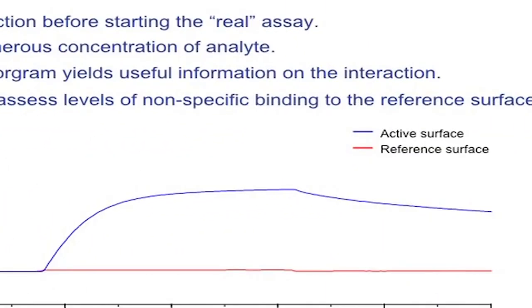Once the experimental conditions are set, the analytes are prepared, and the ligand is immobilized, it's a very good way to start by injecting a small amount of your sample to see what binding responses you are getting, for what time you should continue your binding, and when to dissociate. That process is called test of a surface. You can test the surface to understand the interaction, the regeneration conditions, and the level of non-specific binding coming from these interactions.